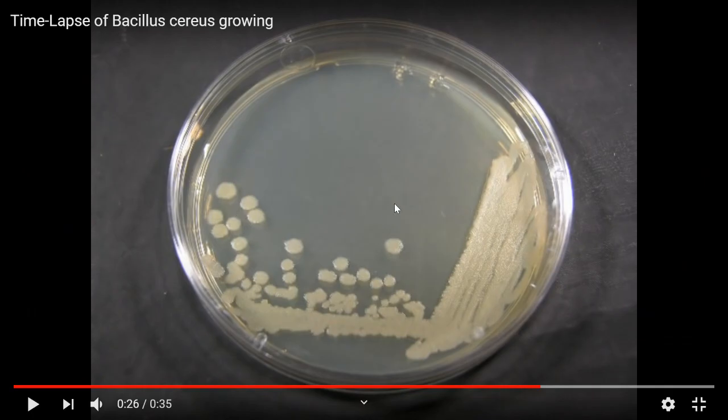Now, this organism is Bacillus cereus. And so what do you know about Bacillus? It has spores. Right, it makes spores. So we talked about where was the best place on an agar slant to find spores.